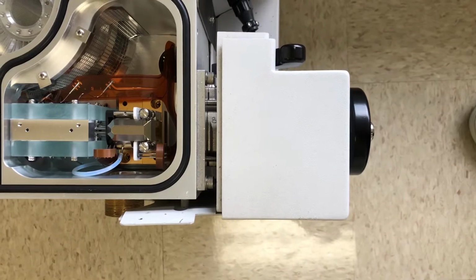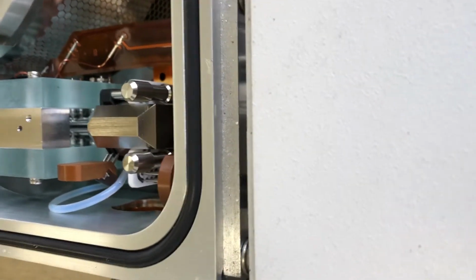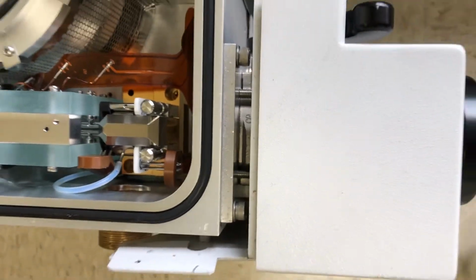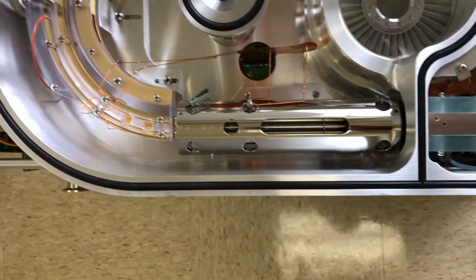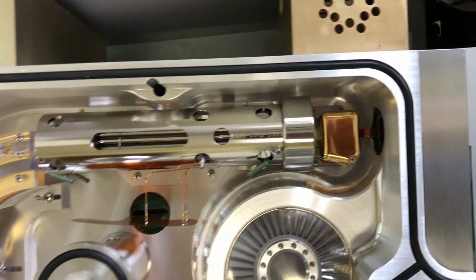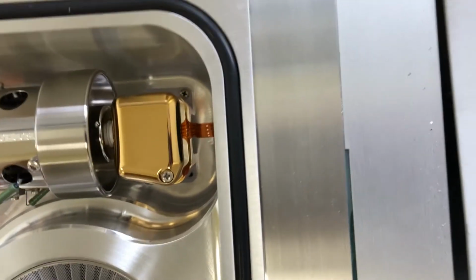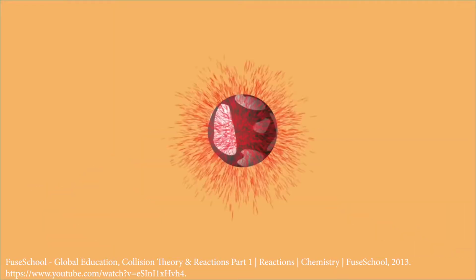Now that we've looked at some block diagrams, let's go real instrument. So this is the ion source for the instrument. This is where the sample comes in. In this case, it has to come in as a gas. It's converted to ions. And then this part is the mass analyzer. It's a cool horseshoe-shaped mass analyzer. So the ions fly through the mass analyzer and get sorted by mass to charge. And then finally, they impact on this golden part here at the end. That is the detector.